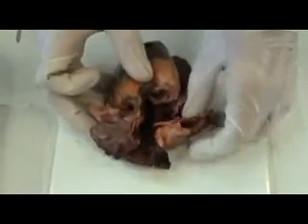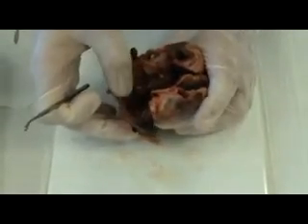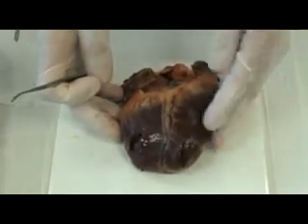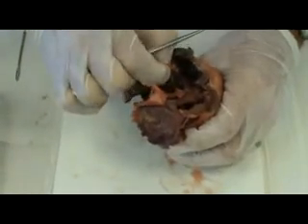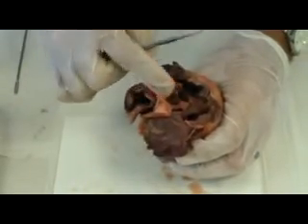So have a play with it, and also have a look at the various blood vessels, and first of all, always try and look for the aorta, and if you go back to the left side of the heart, the aorta is associated with the left side of the heart, and there we have it, part of it, and there's its wall, a thickish wall, and a very elastic wall, that's the aorta.